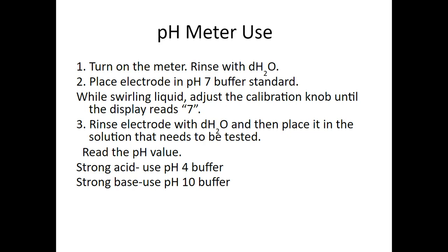Okay, so pH meter use, just if you got your book at home, you can use this too. It's fine. I know some people might have left their books at home. At school, I don't know, in your locker. So that's why it's good here. I'm just, any kind of content quiz I give you, it's going to be based on this slideshow.